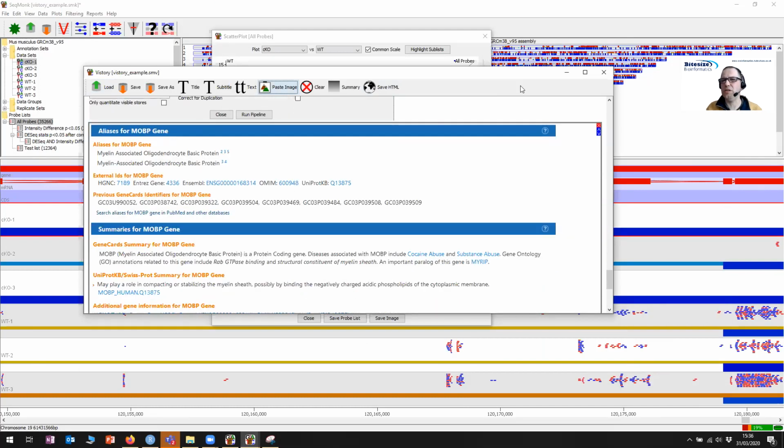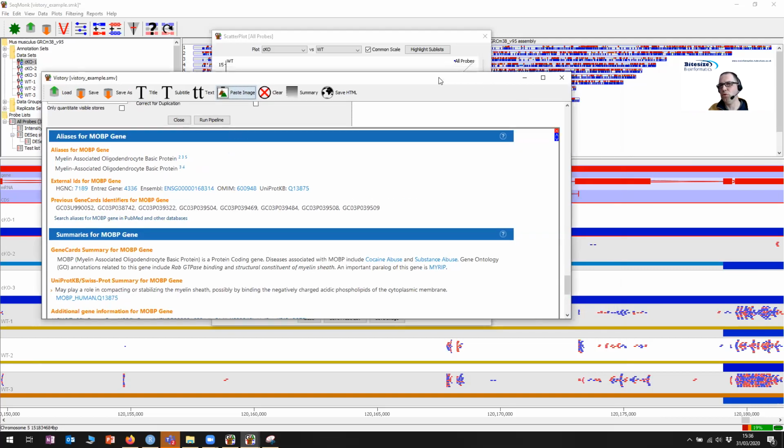So I quite often use this for things like gene ontology results. If I've done a gene ontology search, if I've gone to somewhere like gProfiler, I can just capture the top of that and paste it into the report. It's not a complete record of it, but it's a nice little addition to give some context around what you've got, or taking snippets of papers and inserting those. And it just gives you a bit more flexibility with what you can put in.